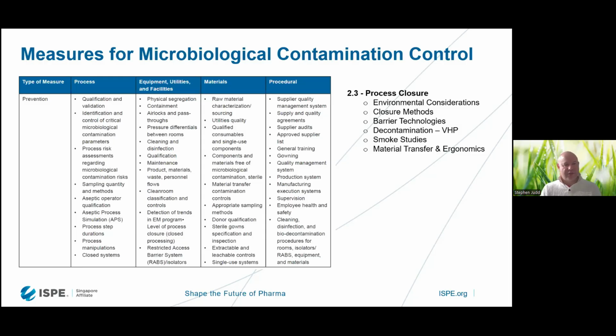Obviously with a BSC, if you're doing an aseptic manufacturing process, you have to have a grade B clean room background. If you are operating within an isolator, and it is defined under Annex 1 as a closed isolator system, which it would be for this type of process, then you can operate potentially with a grade D background, which makes the operation much more streamlined.